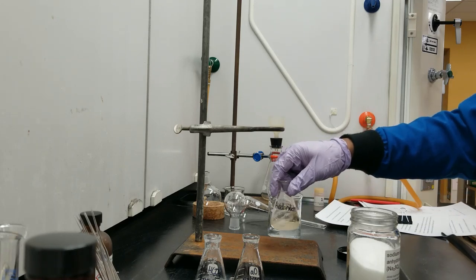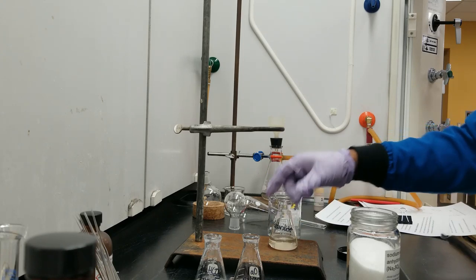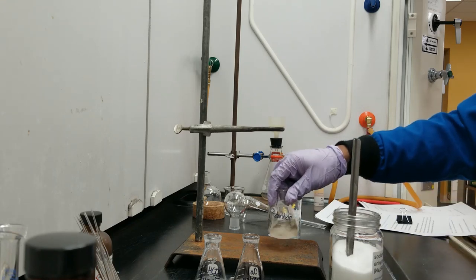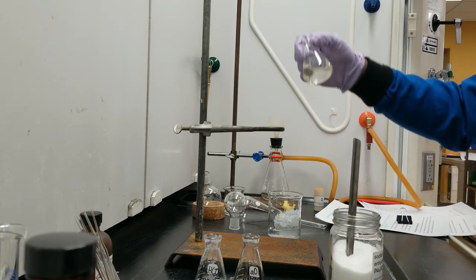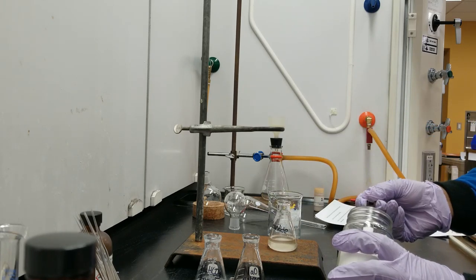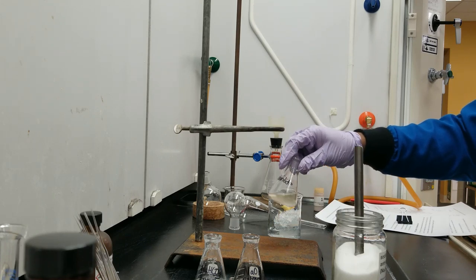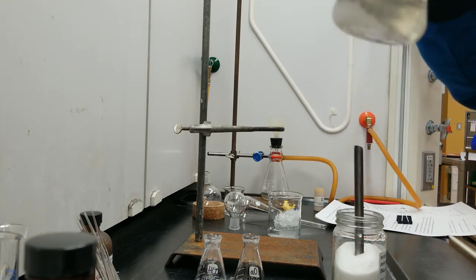After adding each portion, we give the flask a little swirl. We keep on adding sodium sulfate until we see some free-flowing sodium sulfate in the flask, because when sodium sulfate takes up all the water, it gets lumpy. So as you can see, this is still lumpy, so I might add some more sodium sulfate. Now the solid is kind of free flowing.